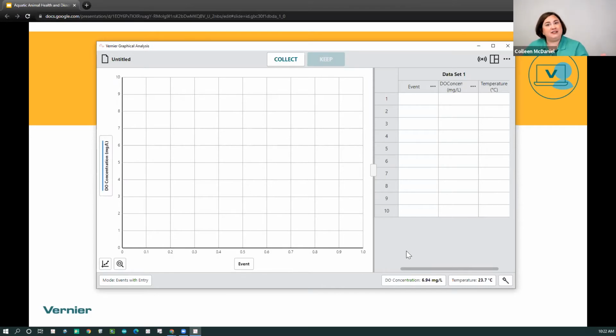Like I said earlier, the only way oxygen is getting into water is either by photosynthesis or diffusion. So by shaking it, I'm increasing the amount of diffusion that can take place and making sure that enough oxygen is actually getting in there, and especially saturating it to that point that I can see exactly how much oxygen this water can actually hold at this temperature.